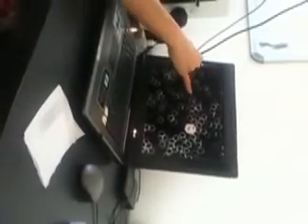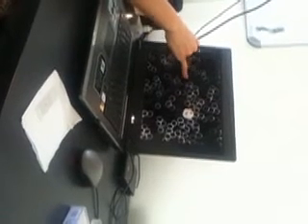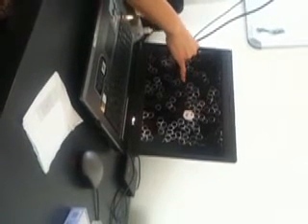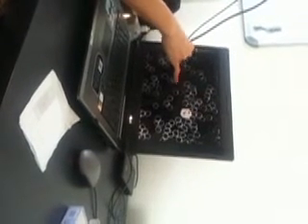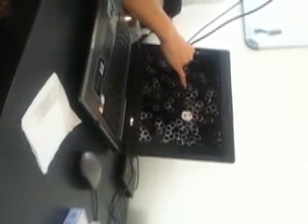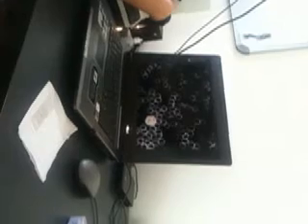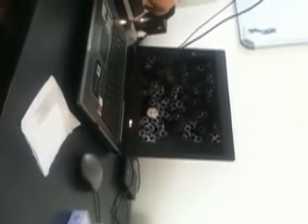You've also, the last couple of months, probably been exposed to some sort of viral infection because you've got mainly most of your lymphocytes have been these atypical with this big ring around them. Yeah, I just had food poisoning like a week ago. Yeah, it's probably not this one. That's probably a couple of months ago. Yeah, I was like really sick bedridden for like two weeks. Yeah, so that would be more like it is.